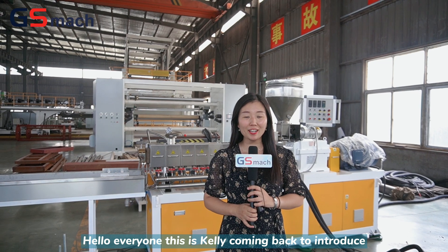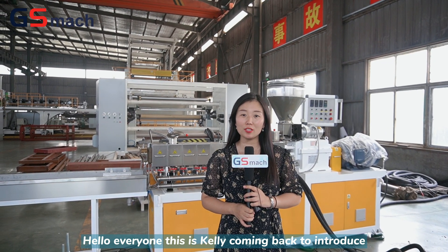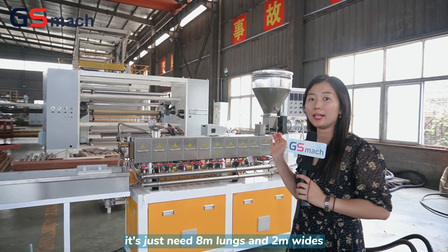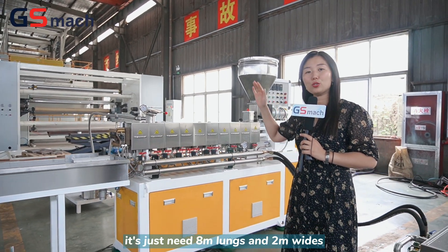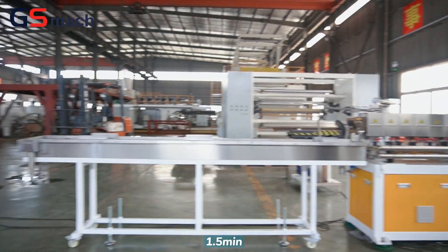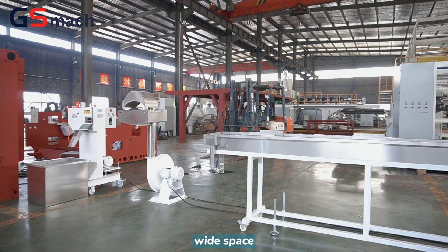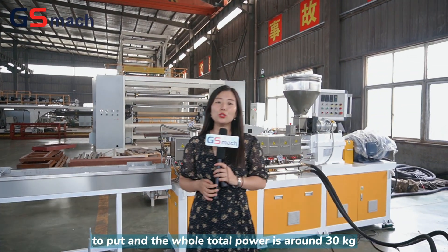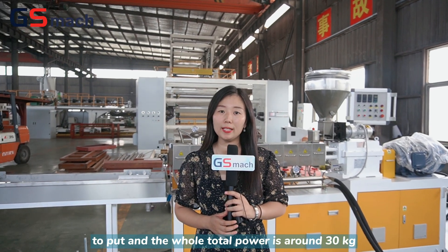Hello everyone, this is Kelly coming back to introduce our laboratory small mini twin-screw extruder for you. For the whole line it just needs 8 meters long and 2 meters wide, 1.5 meters wide space to put, and the whole total power is around 30 kilowatts.